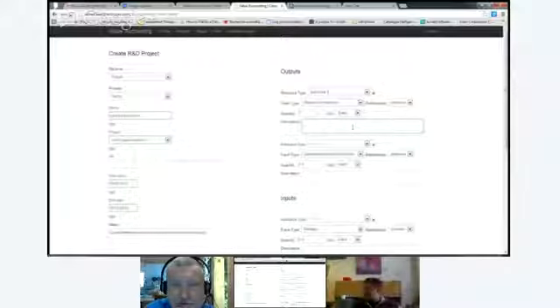You're gonna make 3 to test, right? Yes. Yeah. They are prototypes. Yeah. Okay. All right. Okay. Yep. And then what are you going to use as inputs? So I use equipment. I need the microscope.